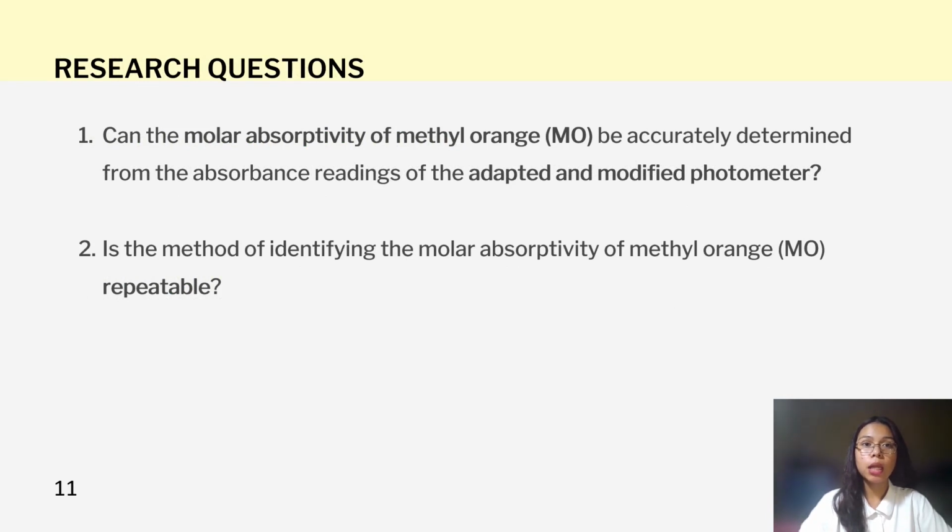Combining the background, literature findings, and significance of the study, the questions of the research are: can the molar absorptivity of methyl orange be accurately determined from the absorbance readings of the adapted and modified photometer? And is the method of identifying the molar absorptivity of methyl orange repeatable?